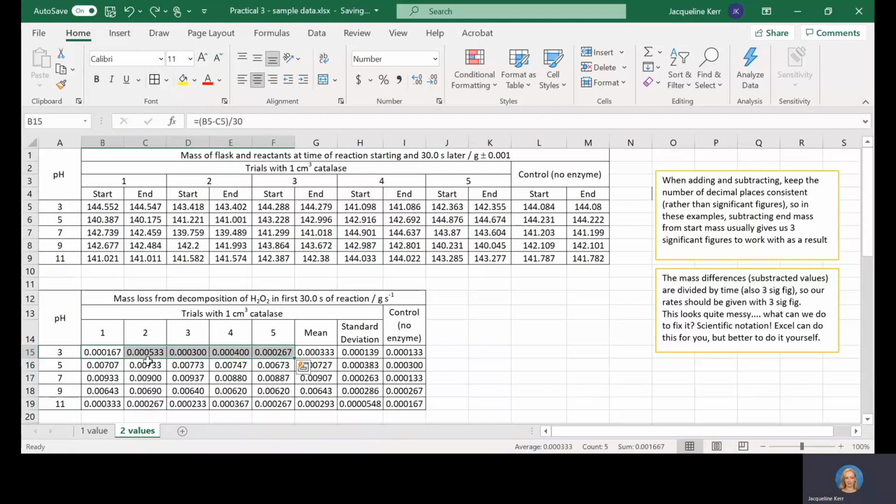What have I done? Oh, sorry, because I've actually gone and changed. Make sure that they're all consistent. I've just fixed the decimal places. That's why they came up a little differently there, because as a shortcut to making sure this video doesn't go on forever, I've already adjusted the number of decimal places so that they have the right number of significant figures.